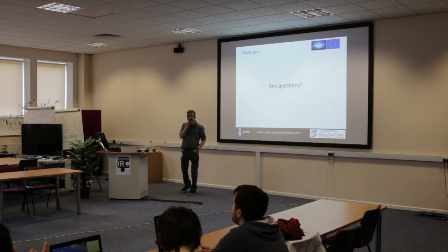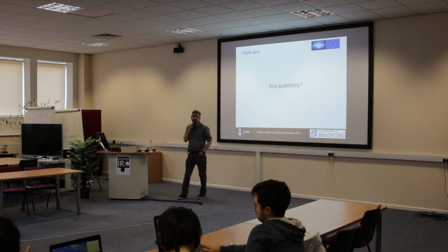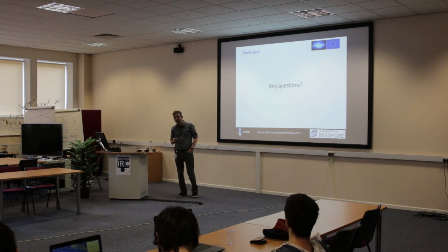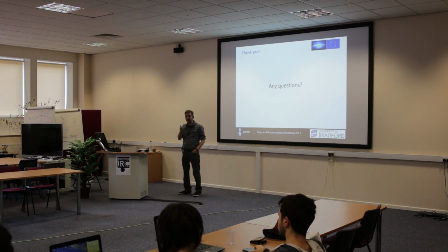Do you have a heat system in your X-ray? A what? Do you have a heat system? Yes, in your X-ray? We have heating, we have grazing incidence, so we can look at surfaces. We bought every possible sample environment, basically, so that we can look at all these things. Yes, sir.